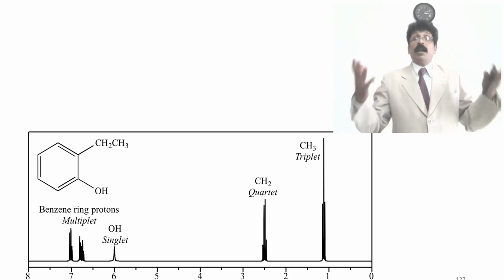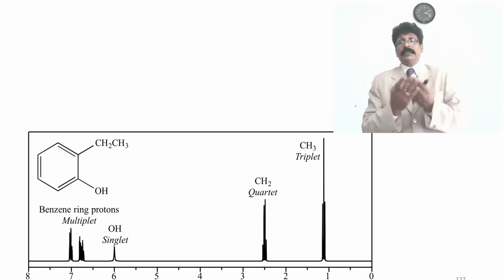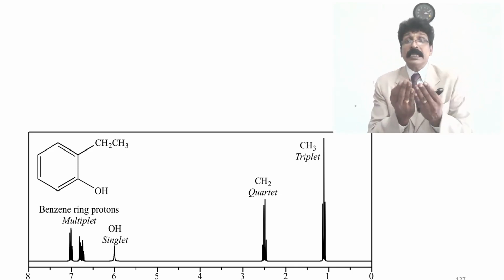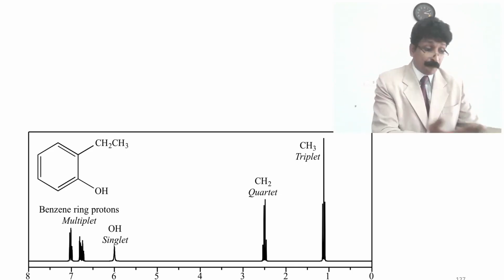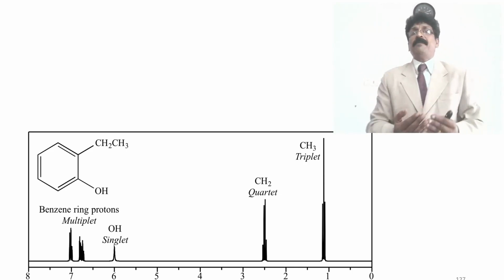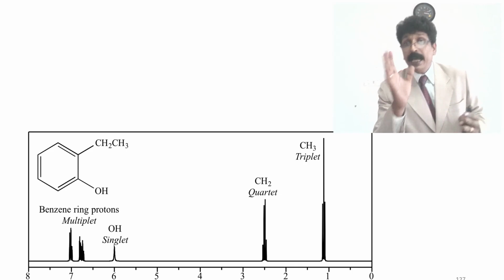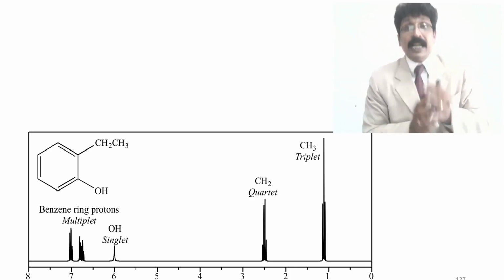There are many experts, and they will interpret. Scholars, research scholars, there are many. You should go and talk. I am giving you basic knowledge for the degree level. But at the research level, they can interpret the graph or the spectrum obtained from NMR, IR and UV and also mass spectrum. They will compare and they will finalize the structure. So I want to give an idea to the students. This is only an idea, basic knowledge. What is the application of the instrument in the structural elucidation of the compound?